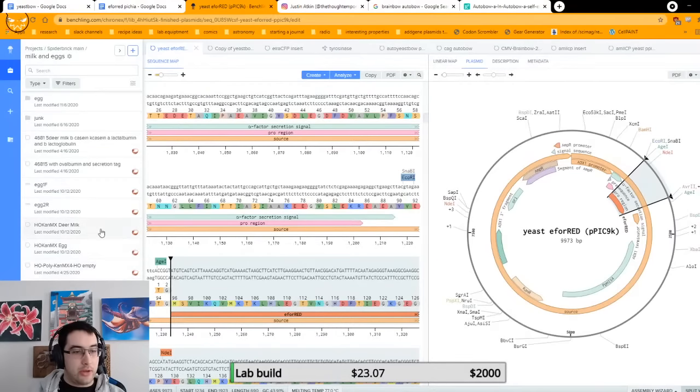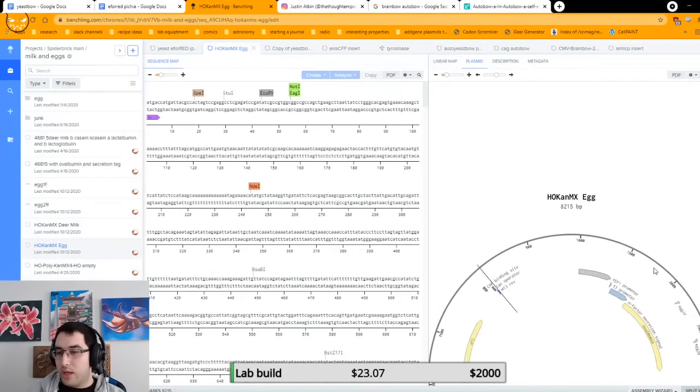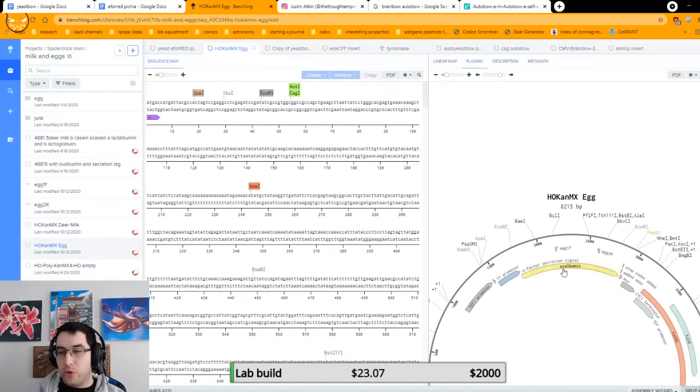So for this, I created two plasmids. This is the first one. Zoom that in because that's a mess. Do you see how this says ovalbumin? Ovalbumin is the main component of egg white. And the idea with this was that you could grow egg whites using yeast.